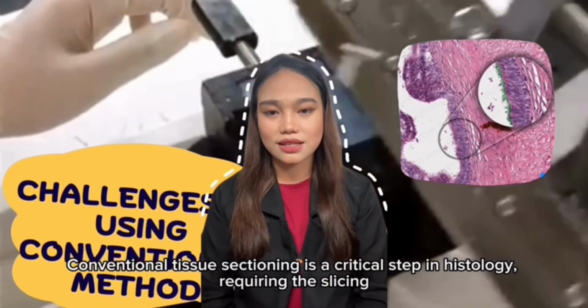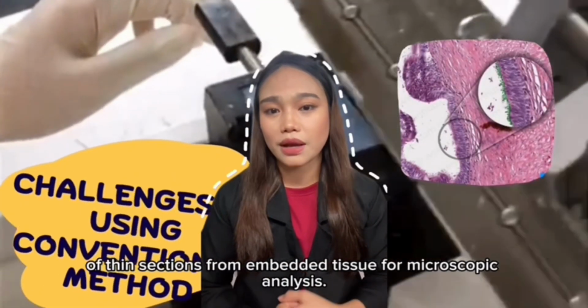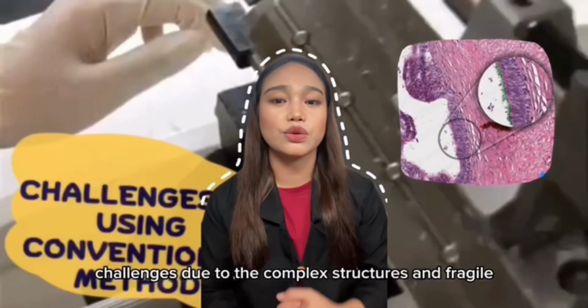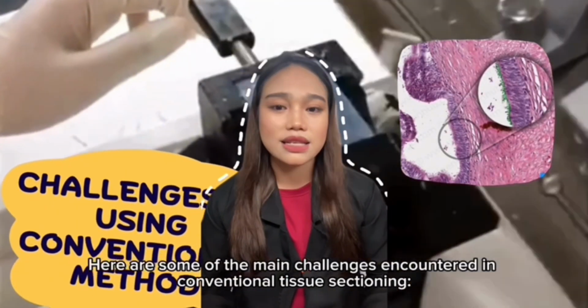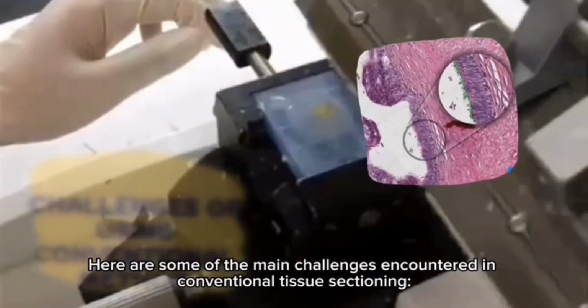Conventional tissue sectioning is a critical step in histology, requiring the slicing of thin sections from embedded tissue for microscopic analysis. This process presents several challenges due to the complex structures and fragile nature of biological samples. Here are some of the main challenges encountered in conventional tissue sectioning.